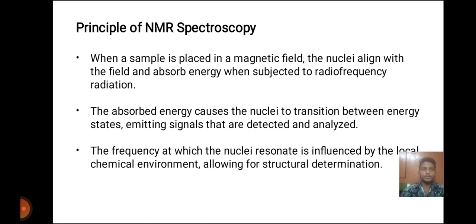Principle of NMR spectroscopy. When a sample is placed in a magnetic field, the nuclei align with the field and absorb energy when subjected to radio frequency radiation. The absorbed energy causes the nuclei to transition between energy states, emitting signals that are detected and analyzed. The frequency at which the nuclei resonate is influenced by the local chemical environment, allowing for structural determination.